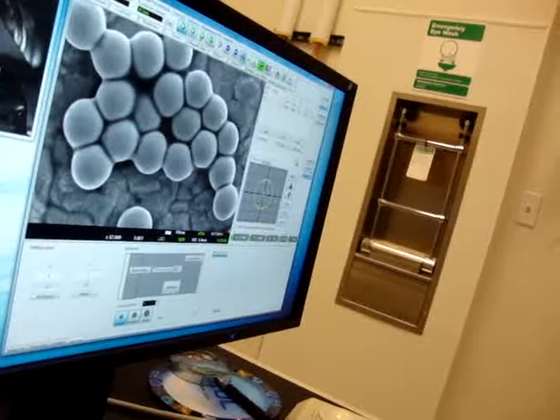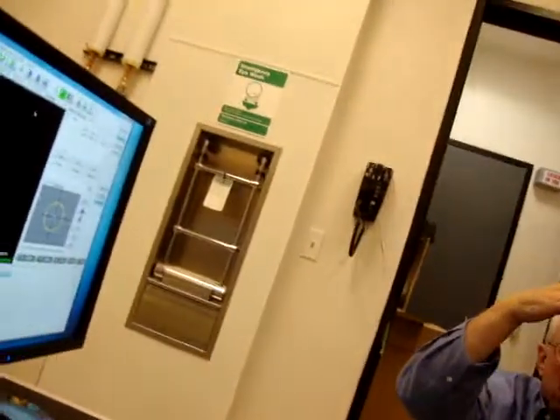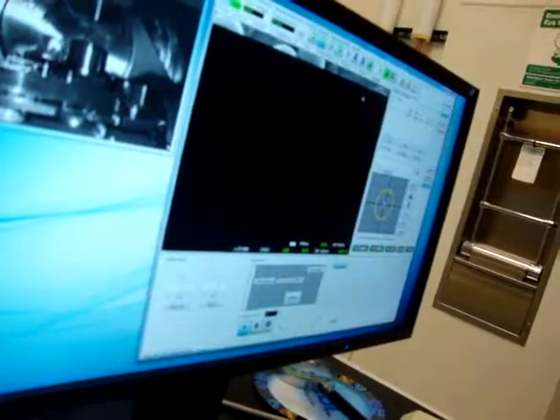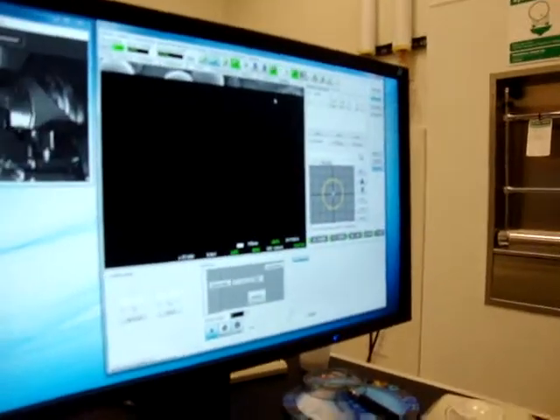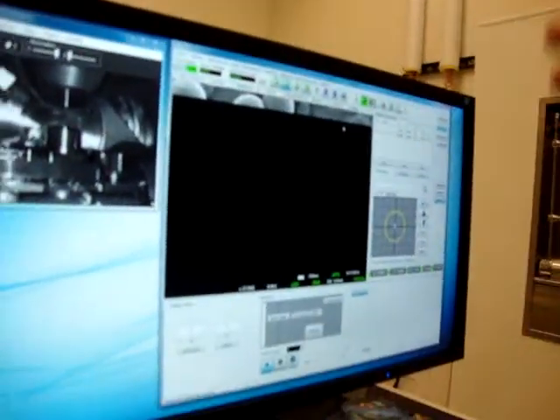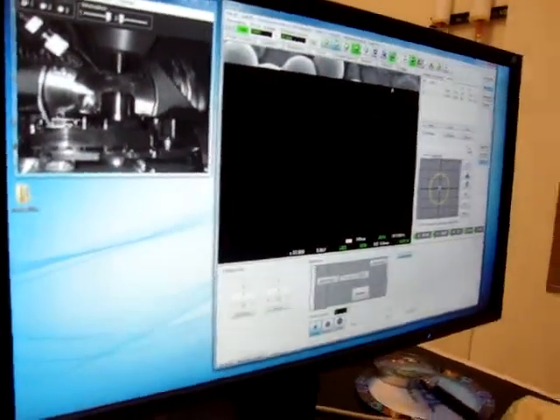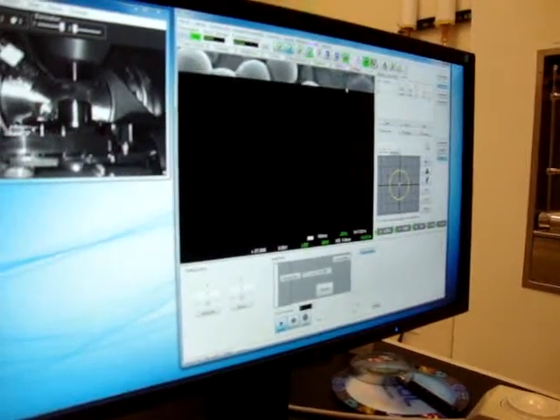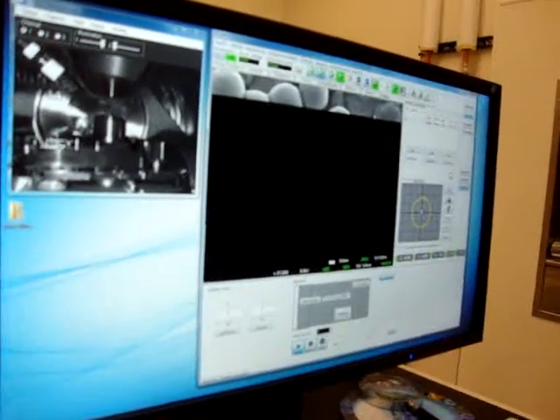Well, let's try HD. I clicked. The freeze goes up by itself, by the way, because it takes a photo, and once it goes through one scan, it's going to stop. So it will just do one scan, not multiple, like 2-3 scans, because you're doing it in slow. Then you have to store it as a save. You have to go file save? Yeah, you have to take it first and then decide what you're going to do with it. You set up your file, and what have you. You make yourself a directory.